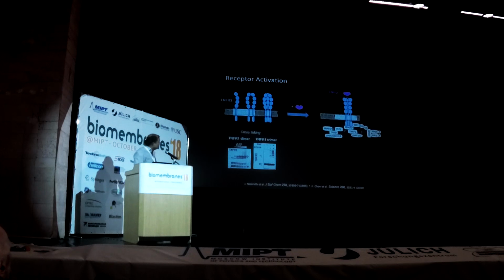So obviously, maybe the cross-linking reagent has an influence. It's quite a drastic process to extract a membrane protein. That's one thing we can study. And the second thing, we can add a ligand, and then we can look at what happens with these proteins that associate to this receptor.